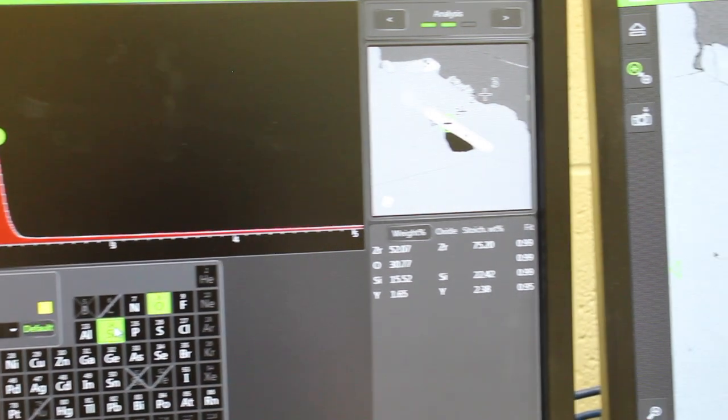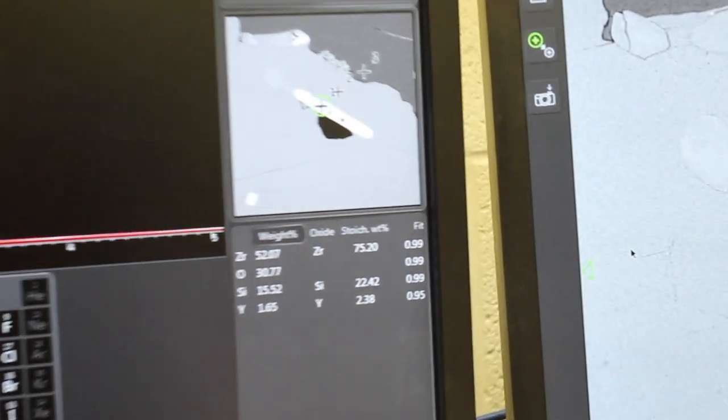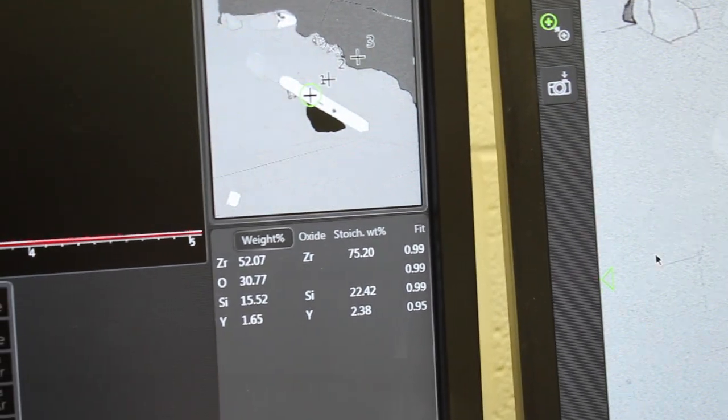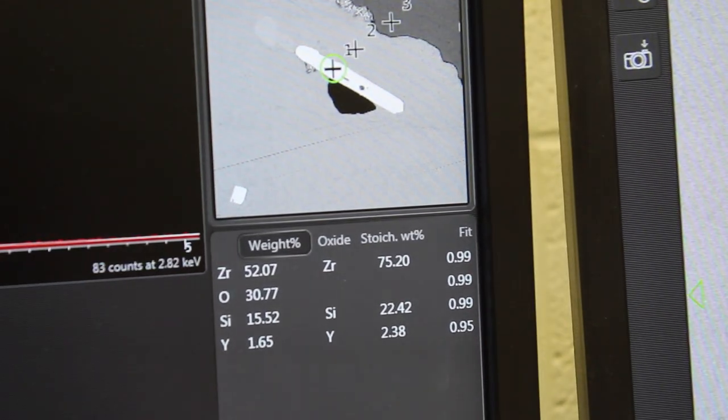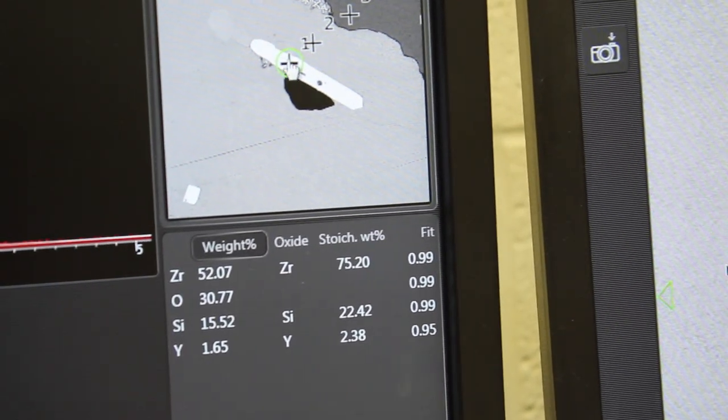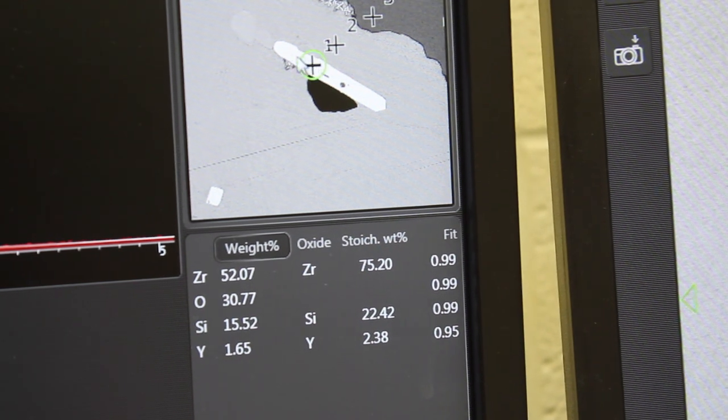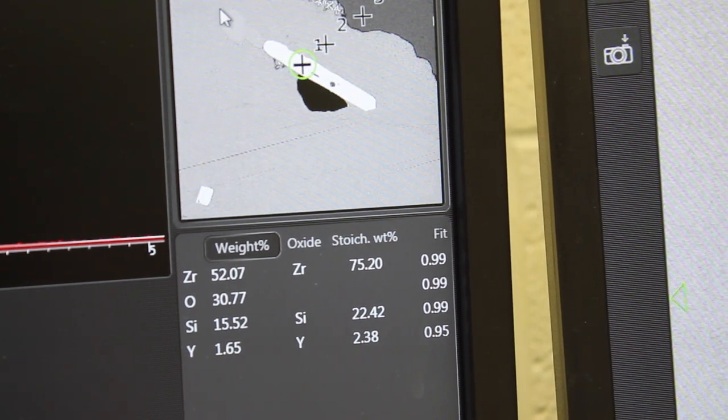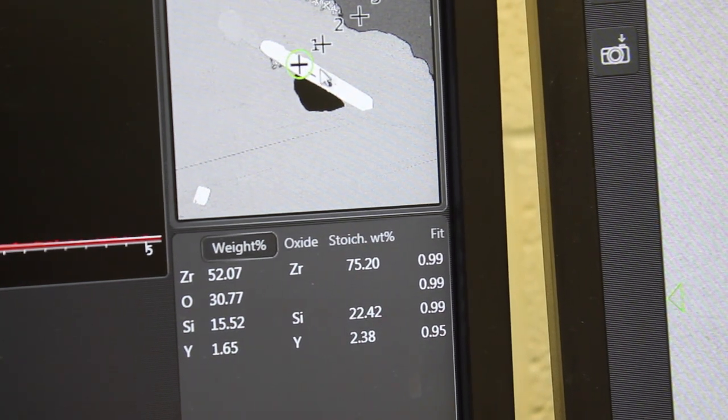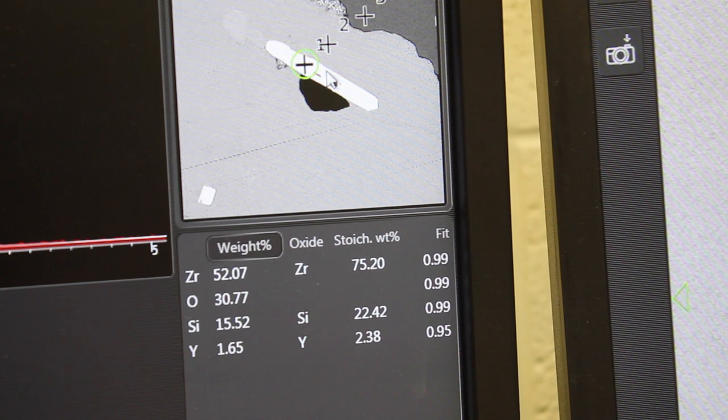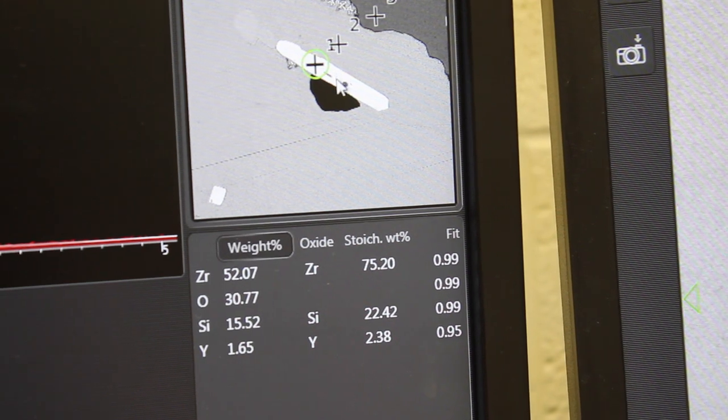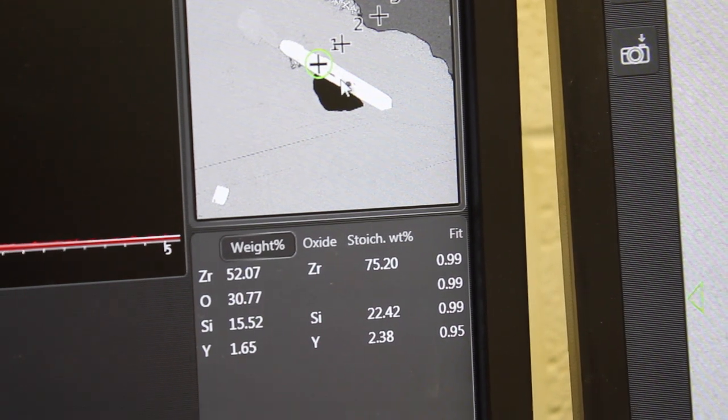It's been very bright in backscattered electron image. It's the number one analysis right here in this very bright, long, skinny, euhedral looking crystal. This is probably a zircon.